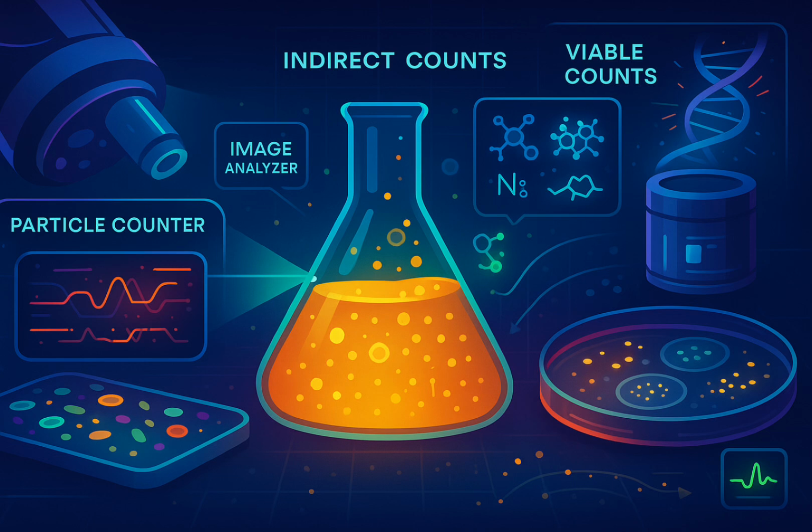Okay, so turbidity: quick, easy, non-destructive sometimes, but struggles with colored or already cloudy samples and that linearity issue. That's a good summary. And cell clumps really throw it off, too. Right, so what if your sample is really turbid or full of particles? OD is out. Other indirect ways: you can measure stuff inside the cells, assays for cellular components, like protein or DNA. Exactly.